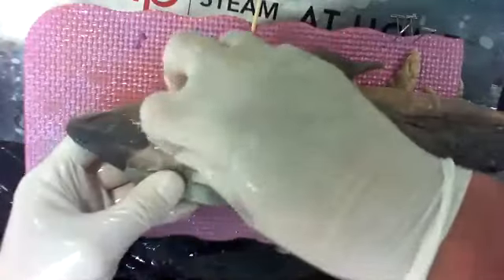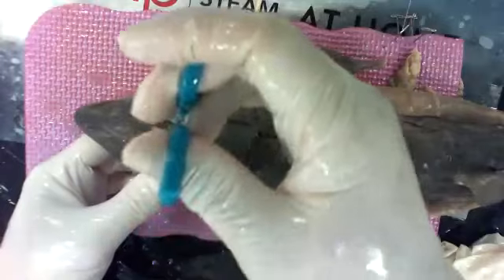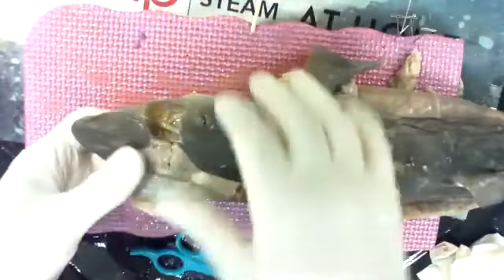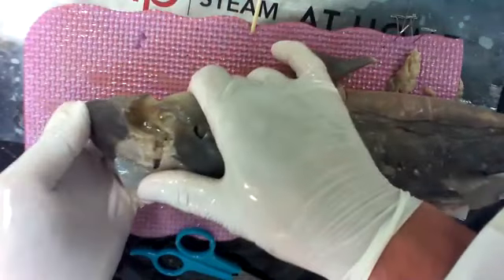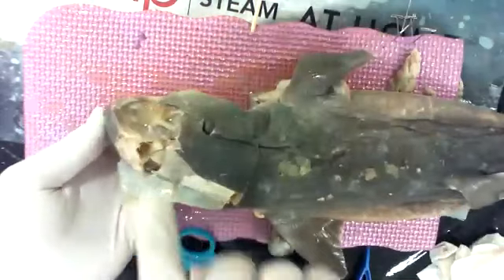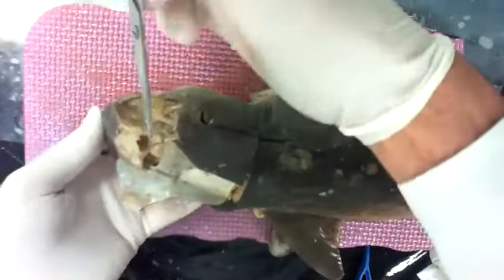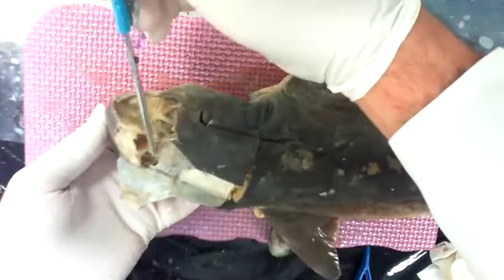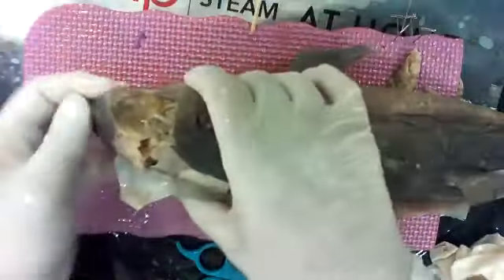And then we can get in. And if we really want to take a shortcut, we can just go across the top. But I just cut the brain, so it's not always the best. See, if I pull like this, there's part of the brain right there. So I took a shortcut, but I damaged the brain at the same time. So you can tell it looks a little bit different than our brain.